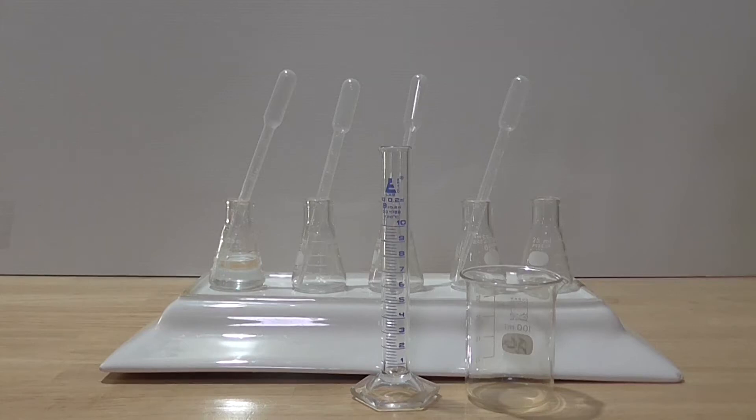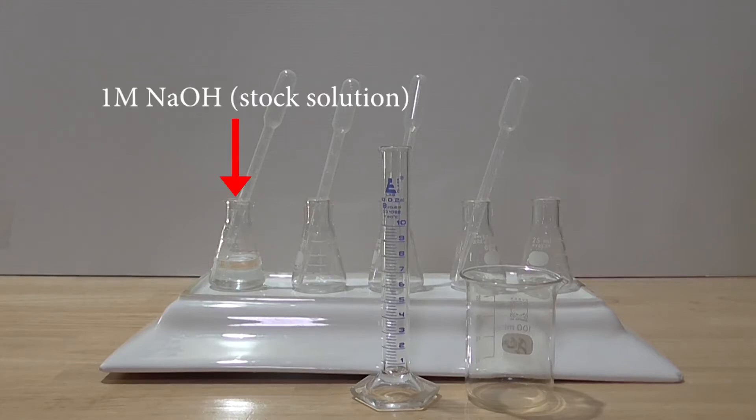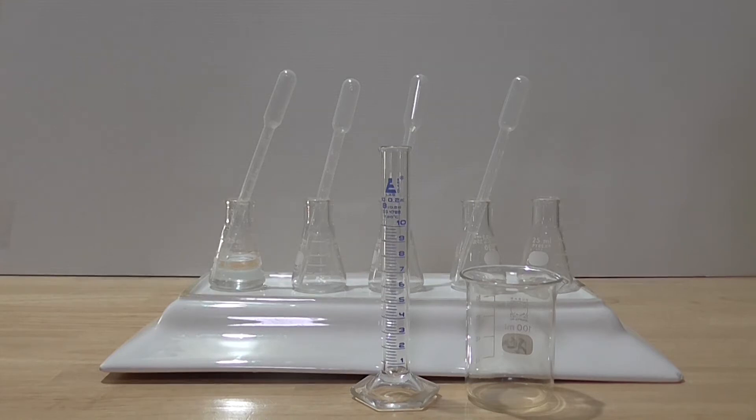In this segment I'll use the principle of serial dilution to prepare four solutions of sodium hydroxide. A one molar solution of sodium hydroxide is needed for this particular experiment. The method for preparing this one molar solution can be found on this channel. The standard volume is one milliliter and the dilution factor is 10, therefore each time a solution of sodium hydroxide is diluted it decreases by a factor of 10. For example, diluting the one molar stock solution by a factor of 10 means the next solution is 0.1 molar. Diluting the 0.1 molar solution by a factor of 10 gives the solution a molarity of 0.01.